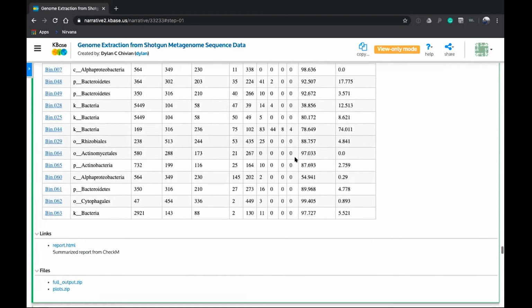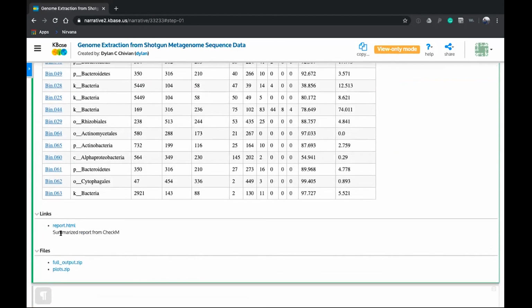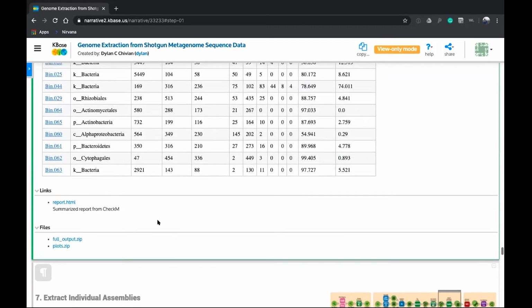Scroll to the bottom here. And you can download all of this information and the outputs from the CheckM tool here.